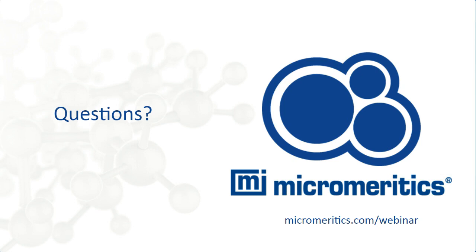So what I usually recommend is to get additional information about your materials. What do you know from the literature? What do you find out, for example, if you do TG analyses? That can help you a lot to see what's going on with your sample, how it behaves at different temperatures. So all sorts of additional information from other analytical methods help you to be sure that the temperature used for degassing is a temperature where you don't change the sample in terms of structure or morphology.